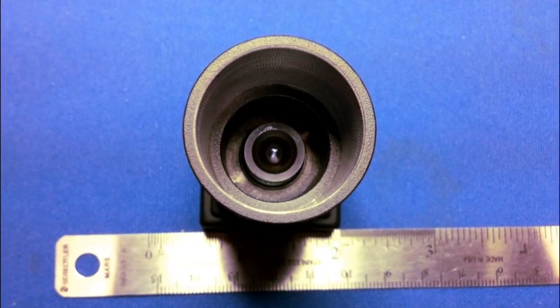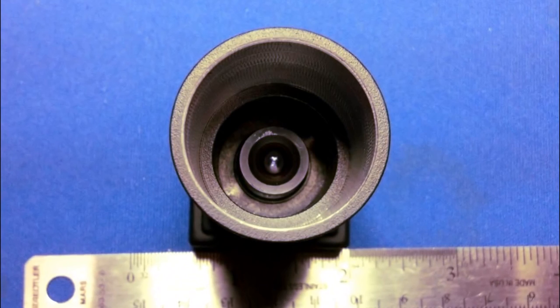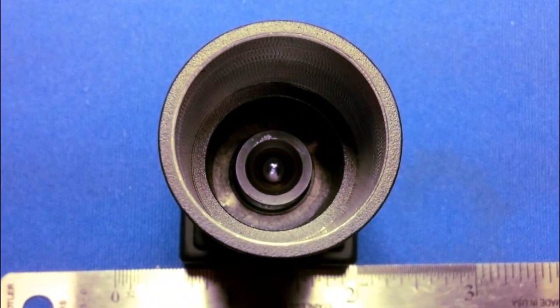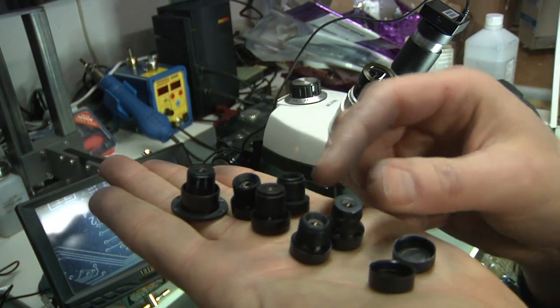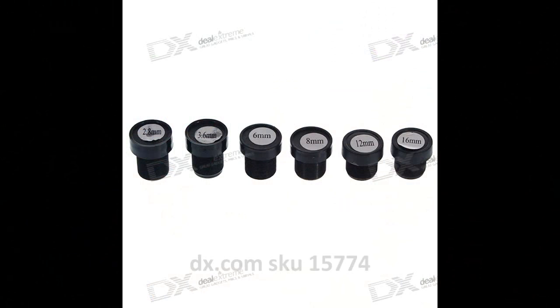Looking down the barrel, you can see the camera lens that I had to change out. This is either a 12mm or a 16mm C-mount lens. I got it as part of a C-mount lens kit from Deal Extreme for like $15.